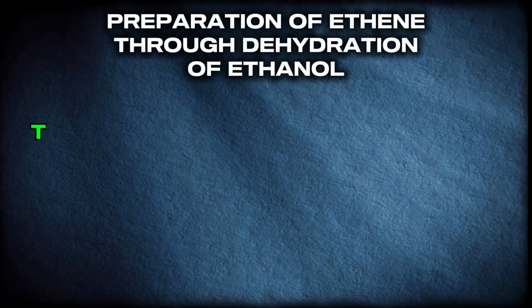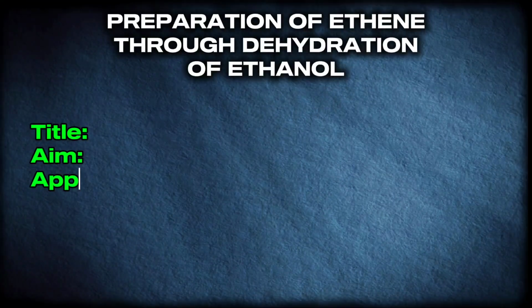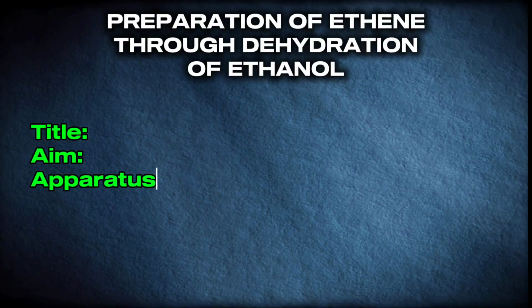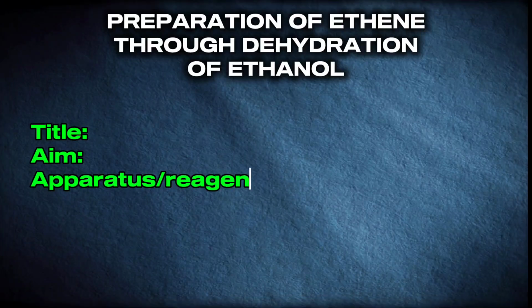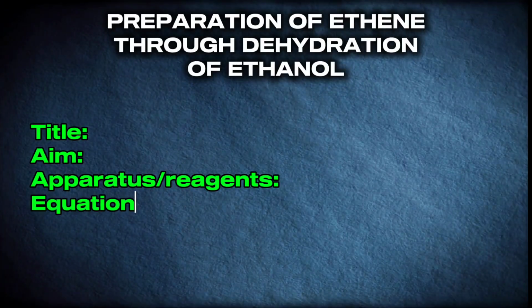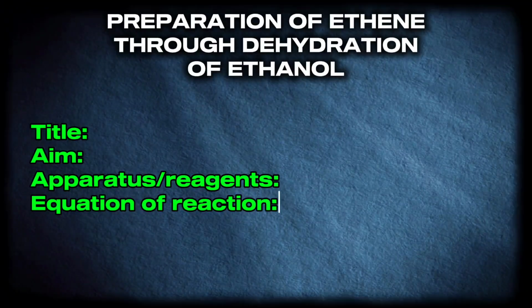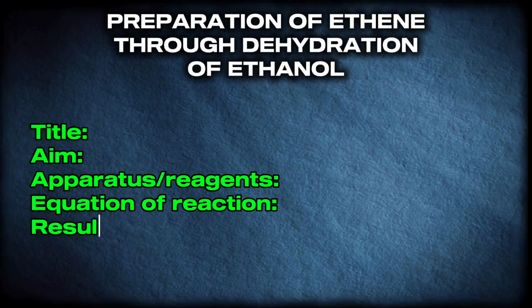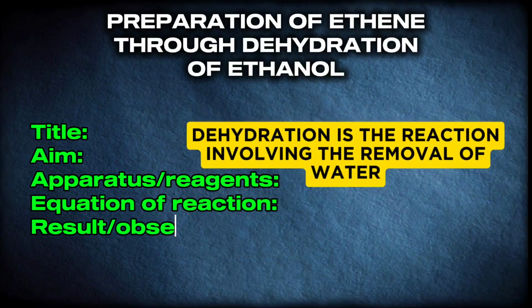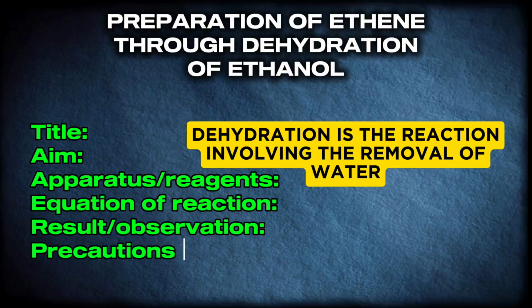This is experiment 2, preparation of alkenes. Precisely, we'll be looking at the preparation of ethene gas through the dehydration of an alcohol, precisely ethanol. So in a nutshell, this experiment is all about removal of water from ethanol, that is dehydration, to produce ethene gas, C2H4, which is an alkene.